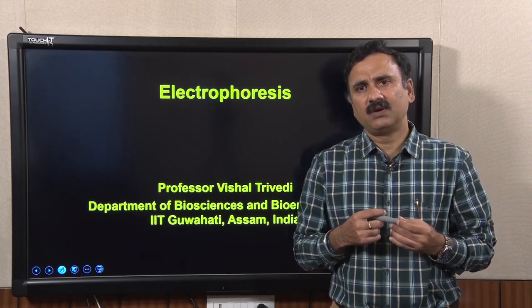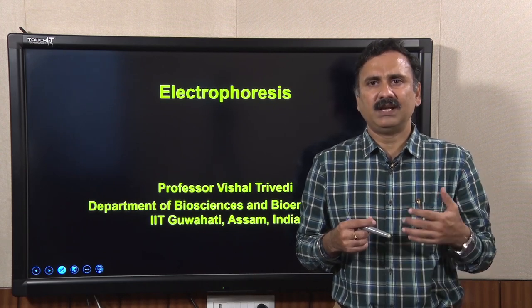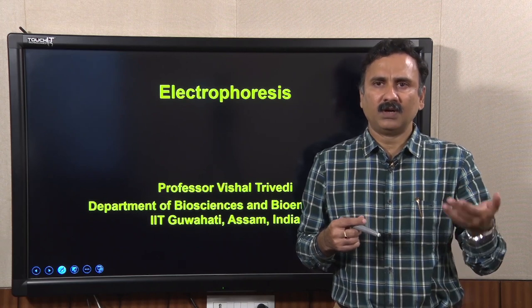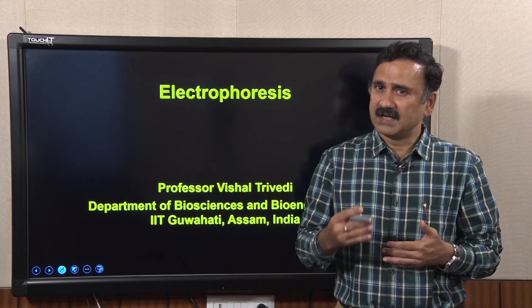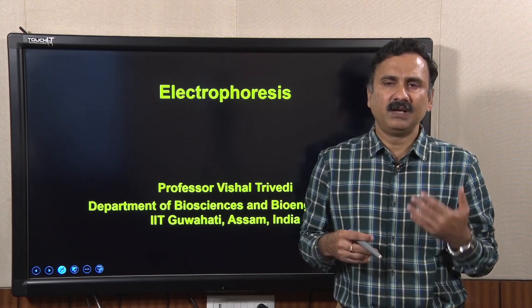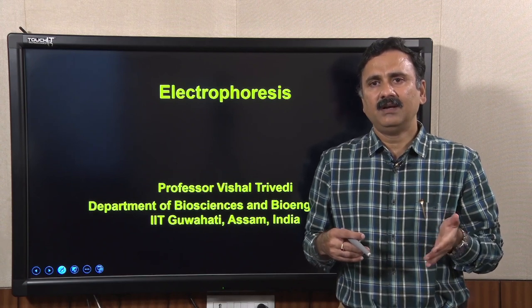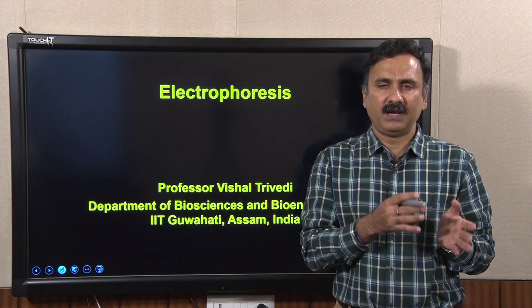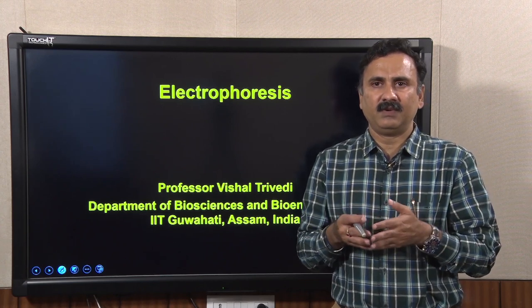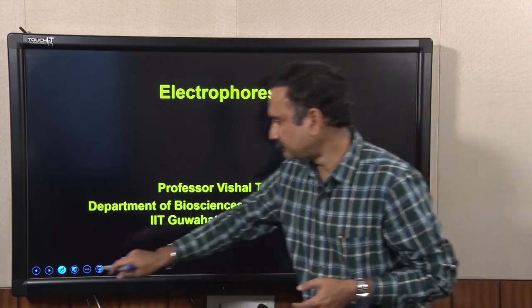In today's lecture we are going to discuss the staining of the gel, and how, once you have the stained gel, you can do the image analysis. We have multiple options in terms of the different types of stain, with different advantages and options available with the different stains.